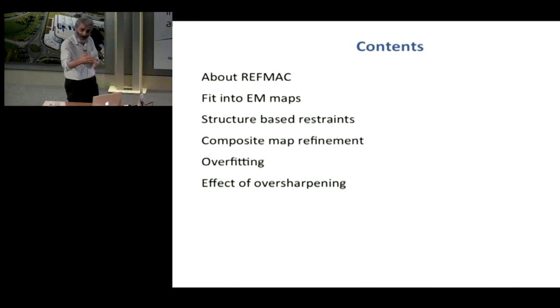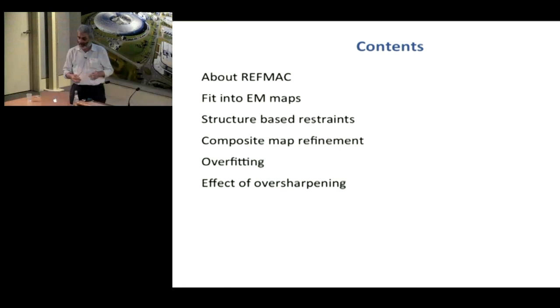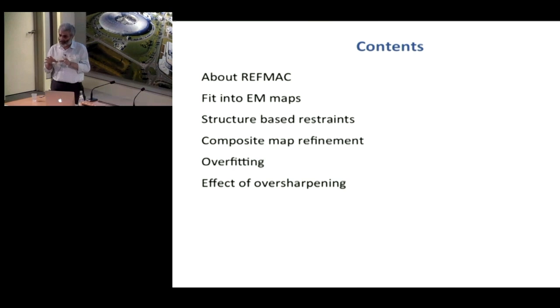Sometimes people claim higher resolution, and sometimes people use tools that are not suitable for cryo-EM refinement and map calculations. And I should tell you that from my point of view, refinement against cryo-EM maps is a young field, and it is still developing, and there will be more development in future.